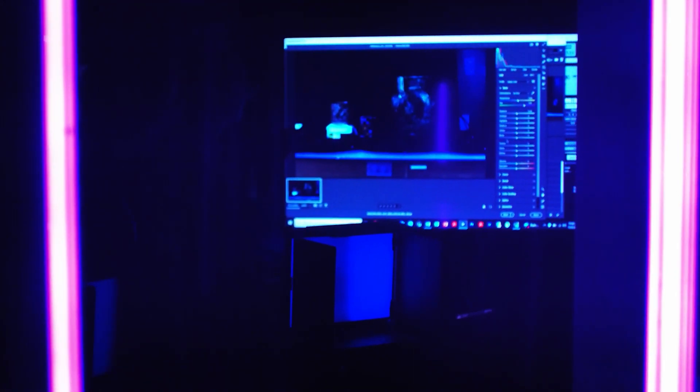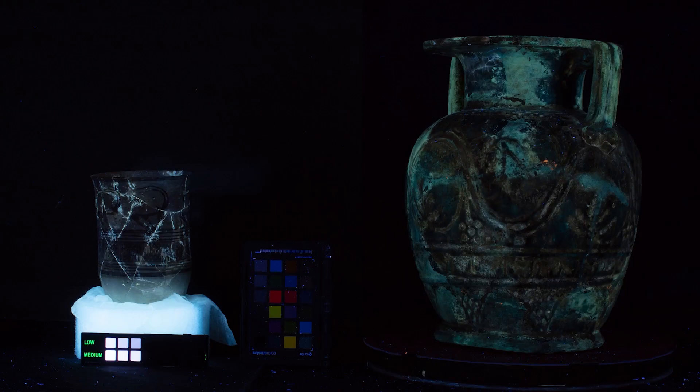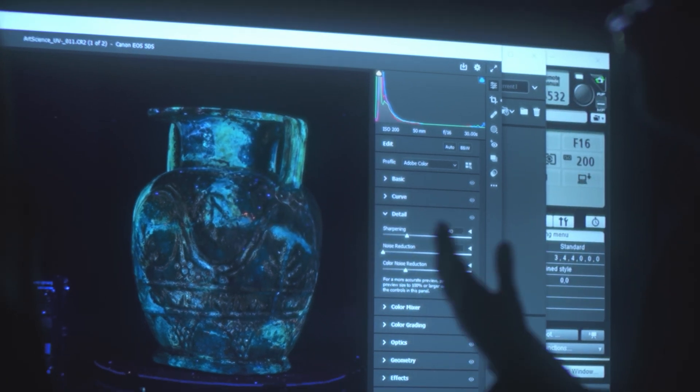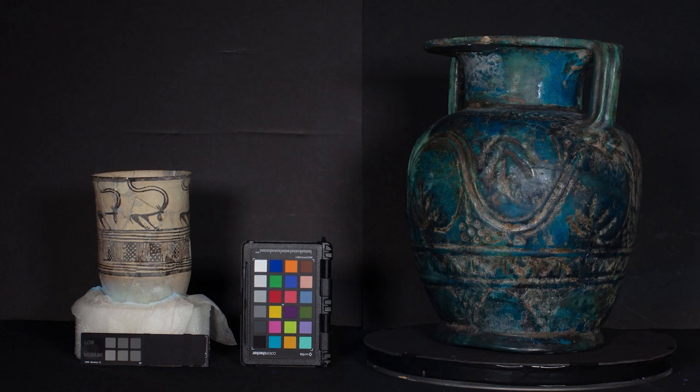How come the cracks are glowing? Because there's adhesive in those and the adhesive is fluorescing back in this whitish color. Where it's darker, that is where the glaze is. Where it's brighter, that is where there's overpaint or repairs that have been made. So a good bit of this has been repaired.